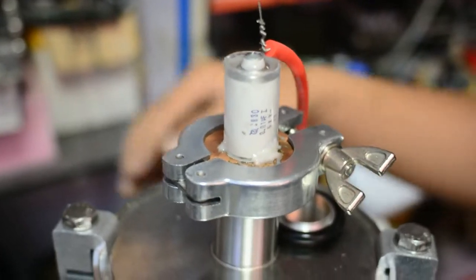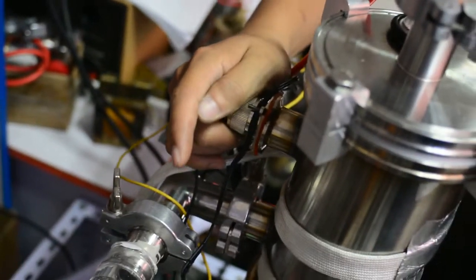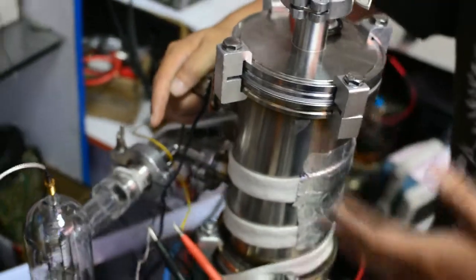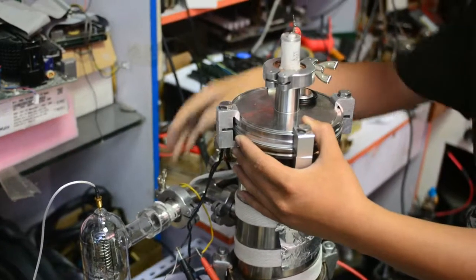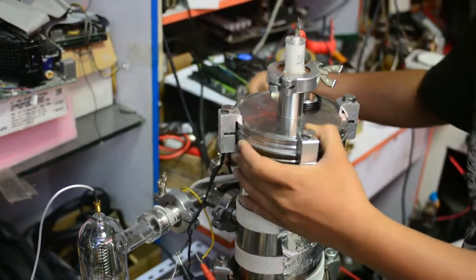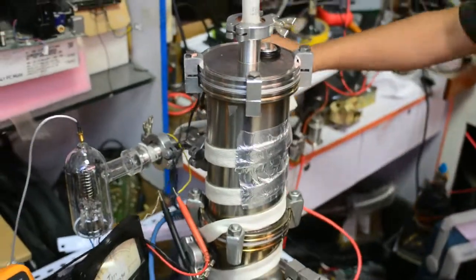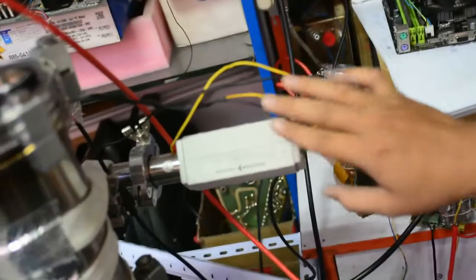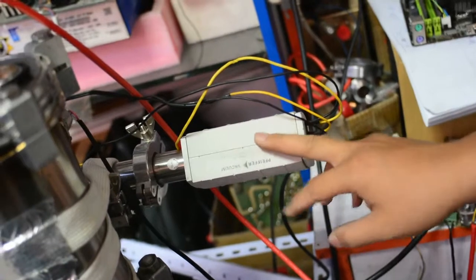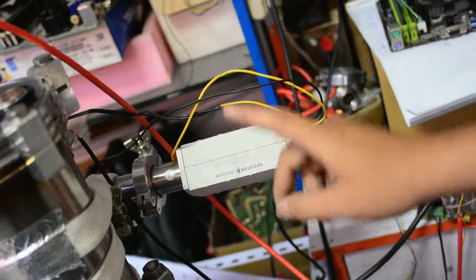This is a low voltage vacuum connector. It provides the electrical connection inside the vacuum chamber of the scanning electron microscope. This is the vacuum measurement system — basically the vacuum gauge. This is the Pfeiffer compact PA gauge, which is essentially a hot cathode ion gauge combined with a Pirani gauge, so it can measure very high vacuum.